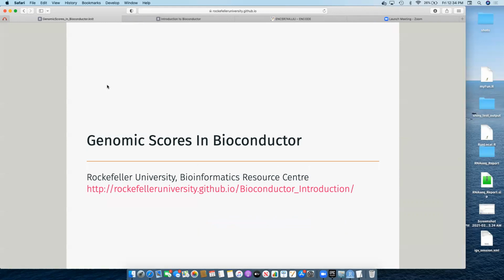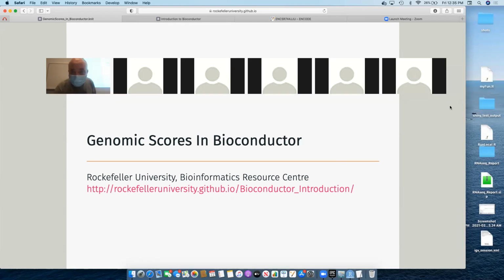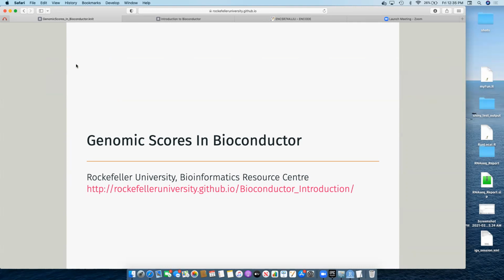So next thing we're going to cover today is kind of the next level of complexity with genomics data. And we're going to start to look at genomic scores. So this lecture is quite short. I think we should be done way before 1:30, but I'm going to try and take my time. Okay. And if you have any questions, throw them in the chat. I think we have David here back. Maybe not quite. Oh, maybe it's off the side of my screen. Nope, but I'm sure he'll be turning up. But if you have any questions, unmute yourself and ask, or just put them in the chat.